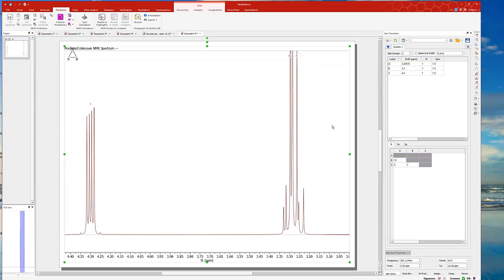Or you can get a totally strong coupled peak like that. When you do that, you can see the chemical shift changing. And if you want to change the couplings, just come here, put in something different, and this is all changed. That's why we call it a full quantum mechanics simulation, with high order strong coupling considered when we simulate the spectrum. And of course, if you want to show the students the difference between such a spectrum and the 60 megahertz, you just change that and do a new simulation.